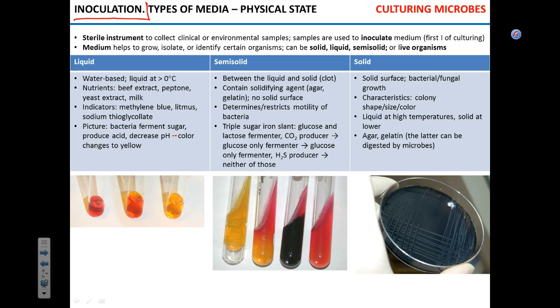That's the first step. So first of all, what is inoculation? Inoculation is placing a microorganism into some type of growth medium. When you collected samples from your palms and swabbed the agar plates, you inoculated agar plates. When you collect samples from the environment and inoculate the plates next week, you will do inoculation.